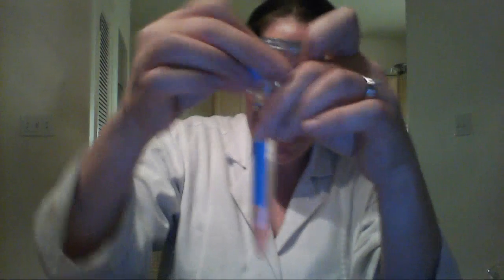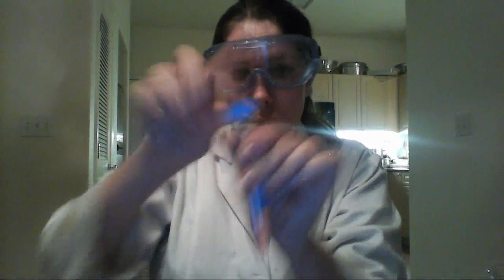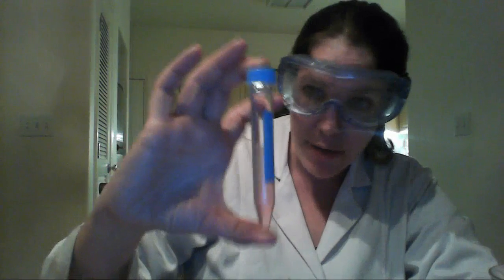Now, I'm going to take the cap, and I'm going to put it on tight, and I'm going to invert this 5 times just to make sure that the DNA is in contact with the ethanol. So to invert this is the scientific way to mix things. You're going to put your fingers on the top and bottom, and 5 times slowly we're going to mix this.